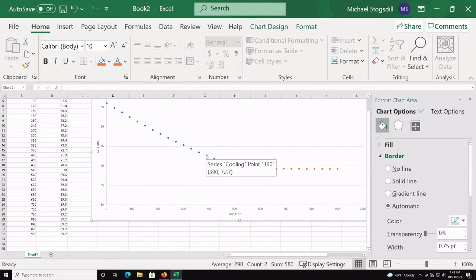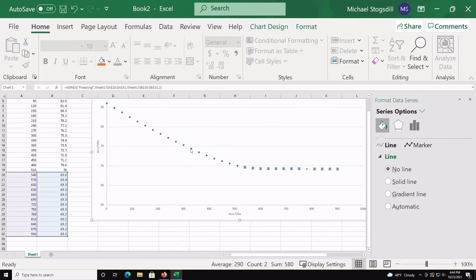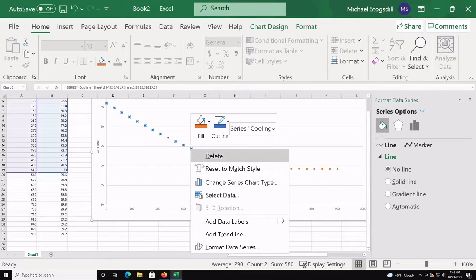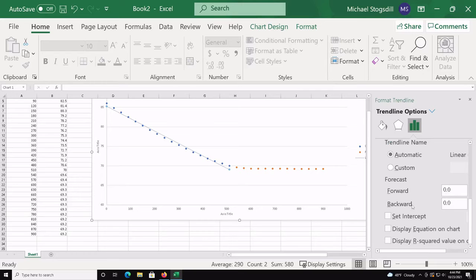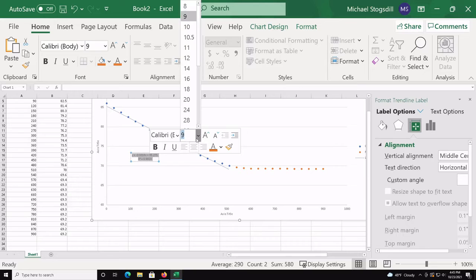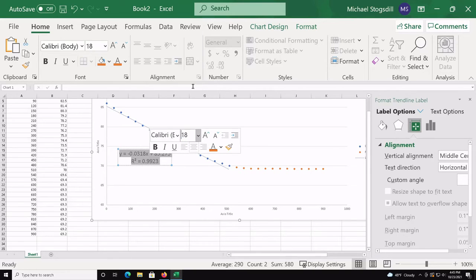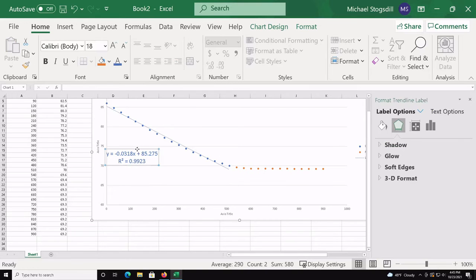When you click on one series, only those points are highlighted, so you can add trendlines independently. Click on the cooling series, right-click, and choose Add Trendline — select linear. Check the boxes to display the equation and R-squared value on the chart. Drag the equation label to a visible position, increase the font size to 18, and color it blue so it clearly matches the cooling trendline.